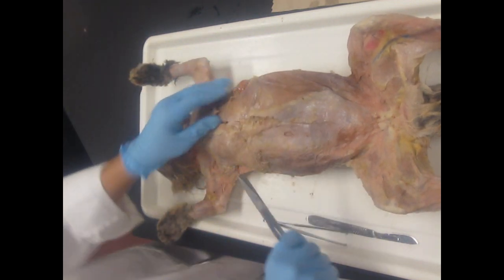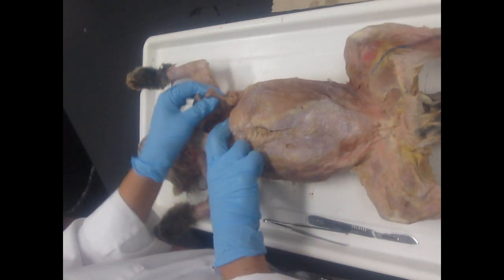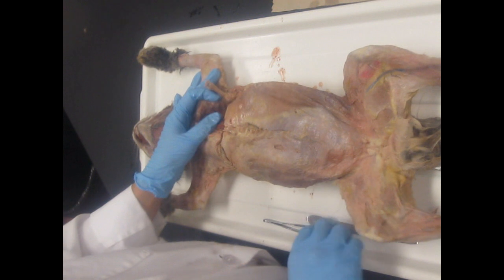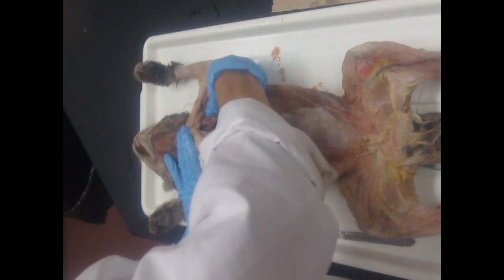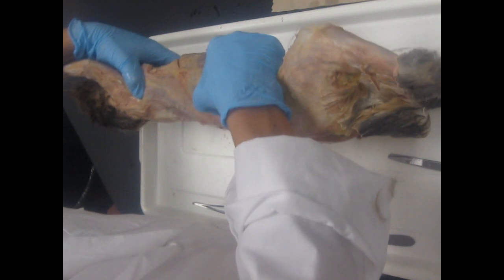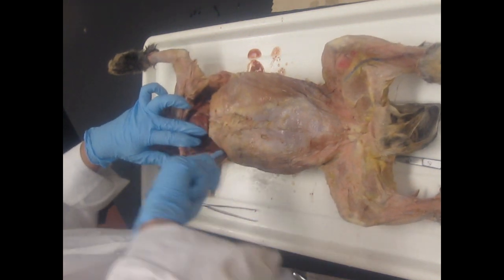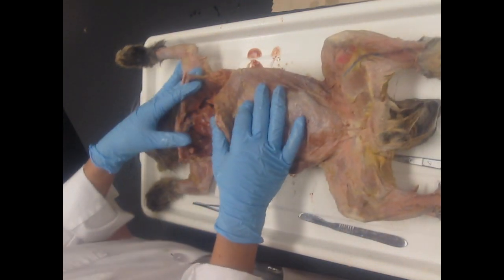Okay. Now once you have those incisions made, you're going to separate the wall of the thoracic cavity from the organs, like this. Get a little bit of that fluid out, preservative from washing out our cat. You're going to take your scalpel and score the ribs, meaning you're going to cut along the bottoms of the ribs as far back as you can to make a little cut along them, and then you're going to push. That's going to relieve the tension of the wall of the thorax so that it stays open and you can view your organs. Okay, so I'm going to do that on the other side. And push. Like that. Now you've got a nice thoracic cavity.